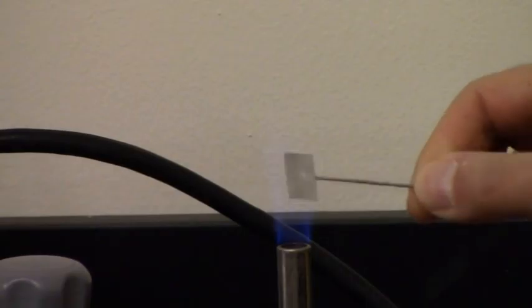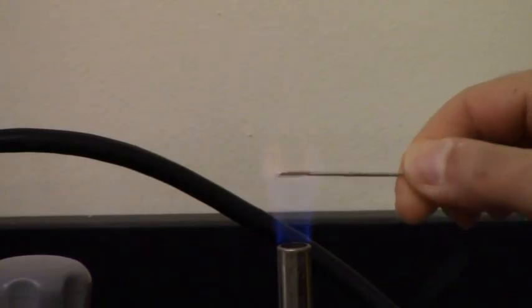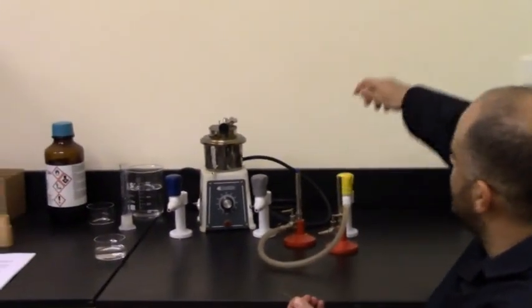So I keep rotating it like this in the flame until it's almost red hot, which is this state. Okay? Now we are ready to get started with the very first part of the experiment.